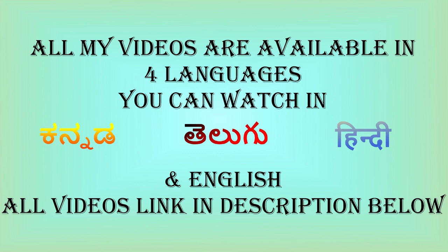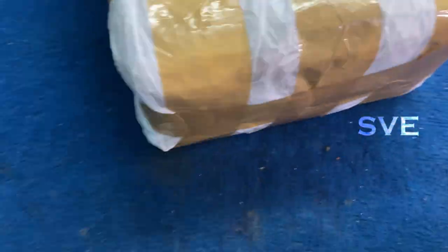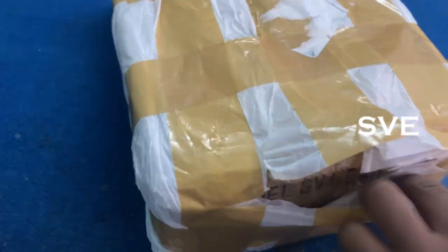Hi, hello, welcome to SVA Electronics. As you can see in the thumbnail and intro also, this one is a microscope package. Have a look at this package. It looks very well packaged. Let's open this box.